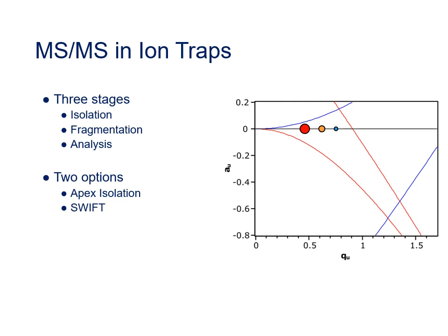Normally, when you're running a mass spectrum in an ion trap, there's no DC offset, so the ions all sit on the Q-axis, like I'm showing here. But when you want to use apex isolation, you add a DC offset, and that means the ions will plot on a scan line like they did when we were using a quadrupole mass filter.